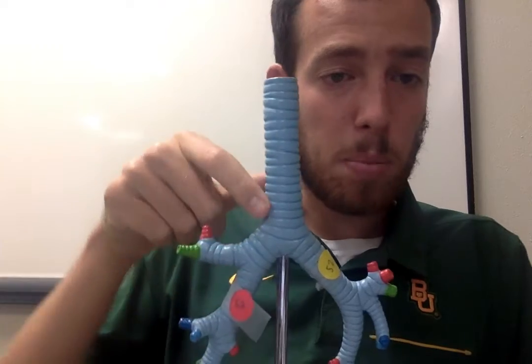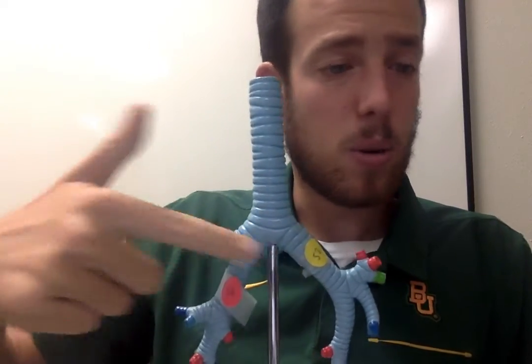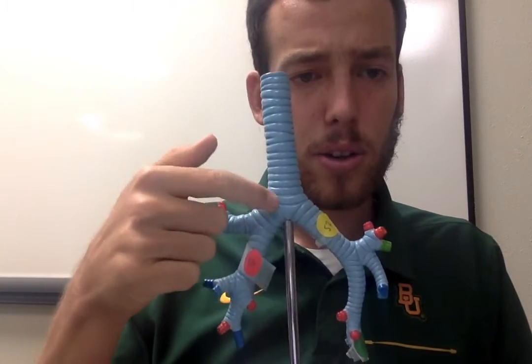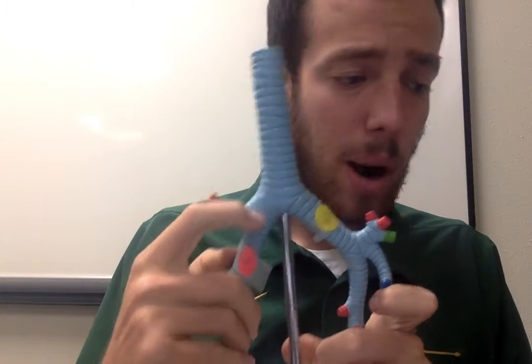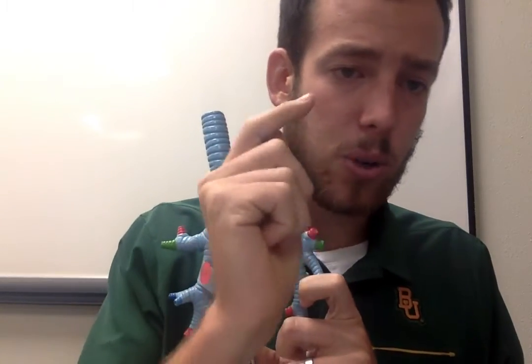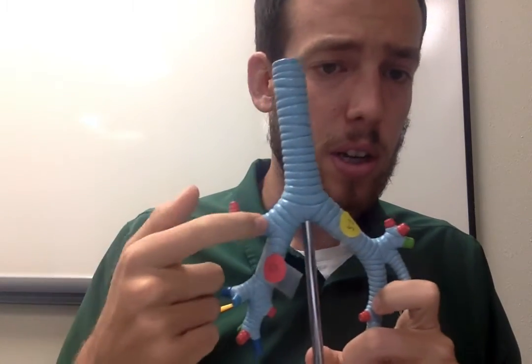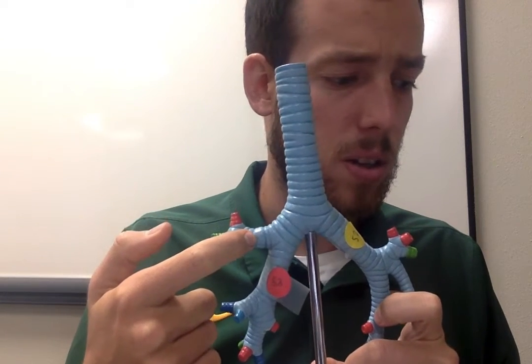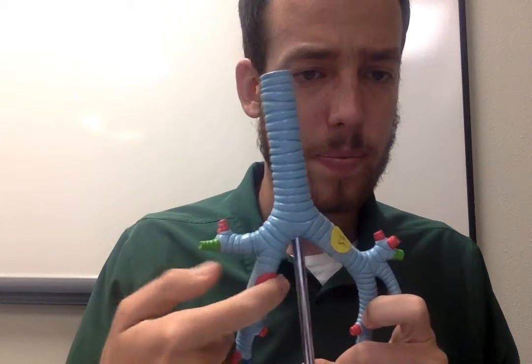Once the trachea splits left and right, those are the primary bronchus. The section right here and right here are the primary. They're directly split. There's only one split, one branch. Once a primary bronchus splits into smaller branches, these become the secondary bronchus, or secondary bronchi.